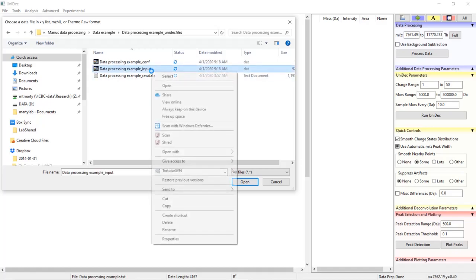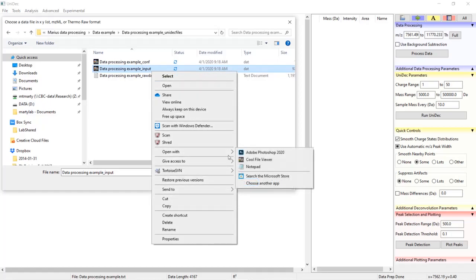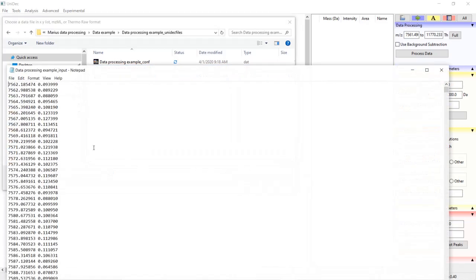If we open this folder you'll see a file with that data name underscore input, and if we open this with notepad you'll find a list of x and y coordinates. These are the coordinates of the mass spectrum in UniDec. You can use this file for plotting in other programs if you're interested.